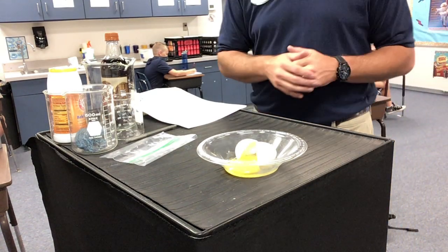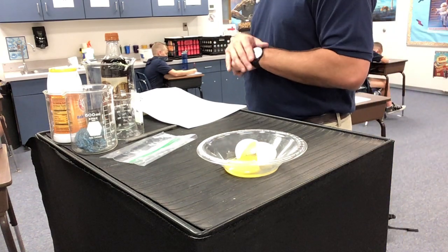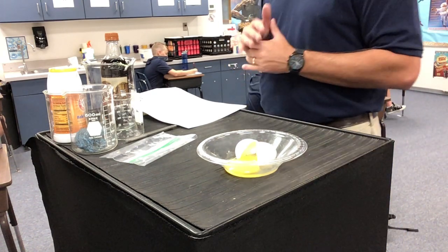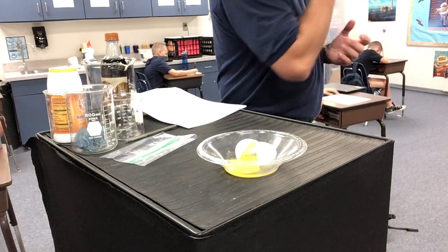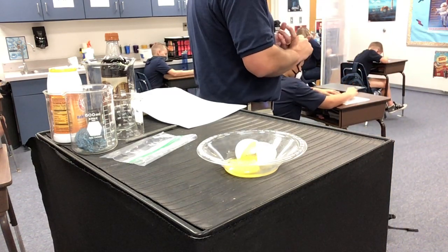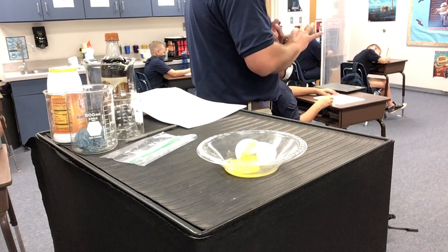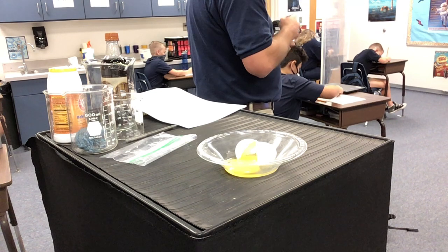So I'm going to give you a second right now to do your lab. The first line, you should be putting check marks or X's if there was a color change. Don't put an X if it didn't happen. If it didn't happen, just leave it blank. If it happened, put a check mark.